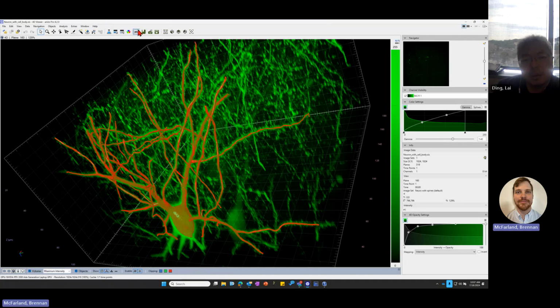So this camera icon right here is being able to just take a really quick screenshot of anything that's in this view right here. So anything in the image here, I can take it and it will automatically generate a, I just clicked it, and then it's kind of like a copy and paste sort of thing.